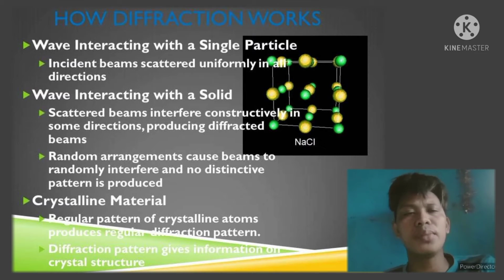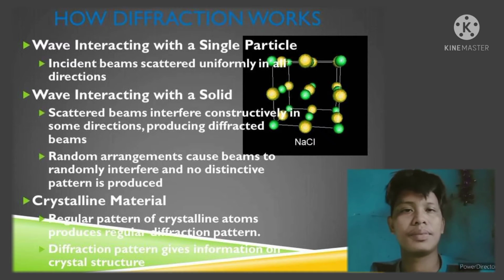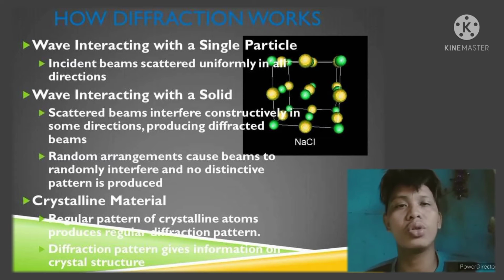X-ray diffraction works through wave interaction with a single particle, wave interaction with a solid, and through crystalline materials. It works through wave interaction with single particles because incident beams are scattered uniformly in all directions.